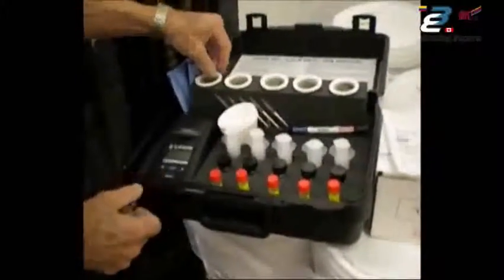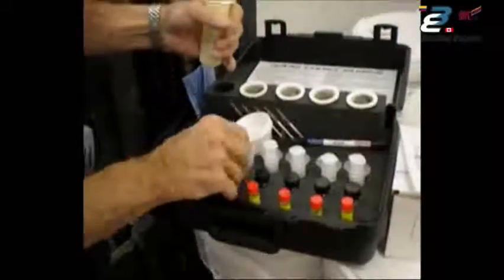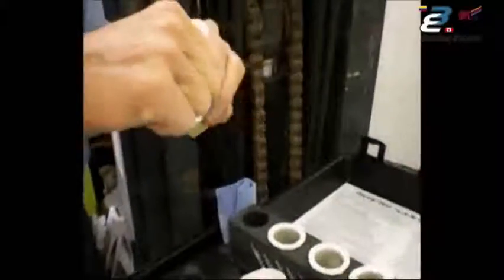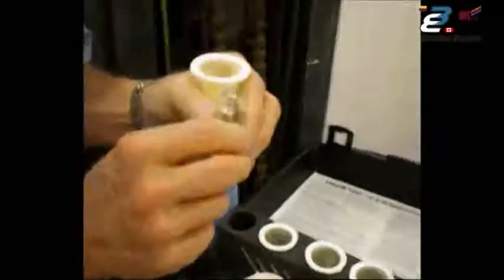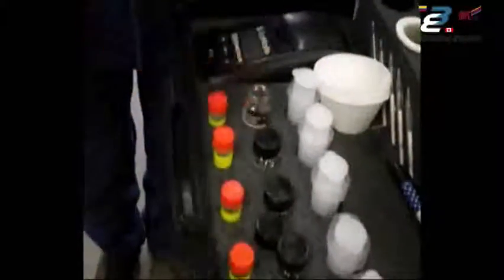To actually perform the test, take the adhesive sleeve and the bottle of chloro extract. This is pre-dosed with the correct volume — it is a chemical extract solution that will extract more salts than DI water or demineralized water by itself. Empty the contents of the bottle into the sleeve and place the bottle back in the holder.